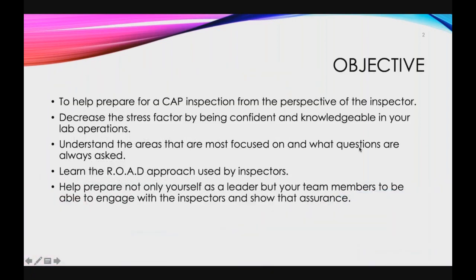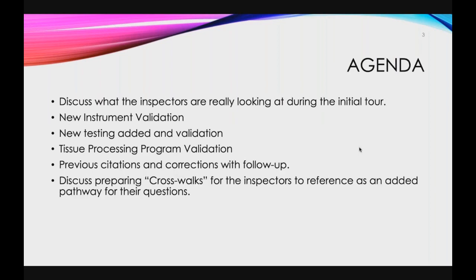Our objectives for this presentation will be to help you prepare for CAP inspection from the perspective of the inspector, decrease the stress factor by being confident and knowledgeable, understand the areas that are most focused on and what questions are always asked, learn what the R.O.A.D approach is and how that is used by the inspectors, and help prepare not only yourself as a leader, but your team member to be able to engage with the inspectors and show that assurance. Our discussion will follow the following format.